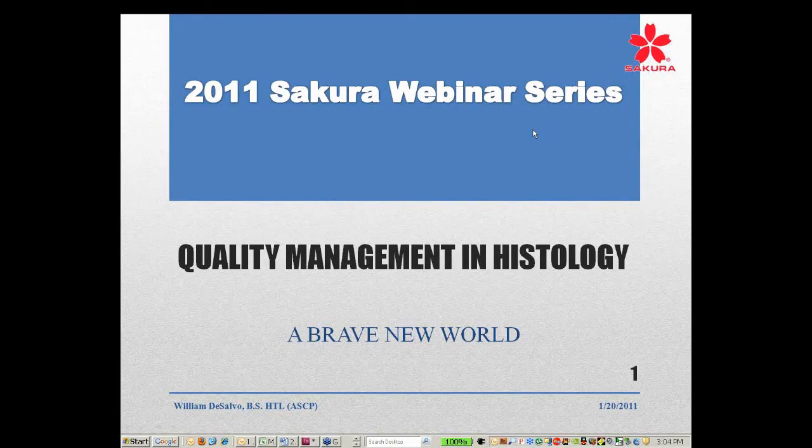Sakura webinar. This one is on quality management in histology. And before we get started on this particular webinar, there are a few things that we need to think about and understand. First of all, you have to be thinking in a system method. You need to kind of open yourself up to new things, new ideas.